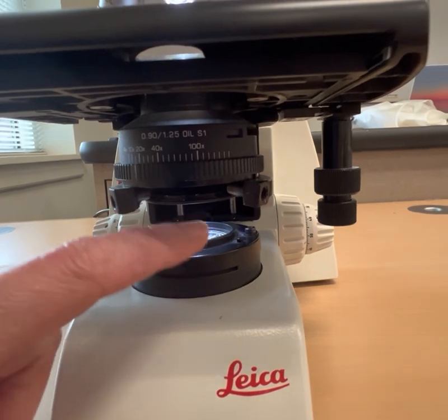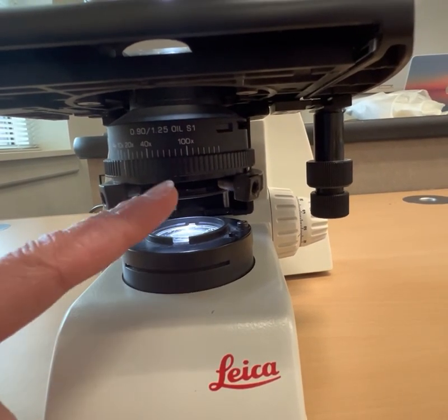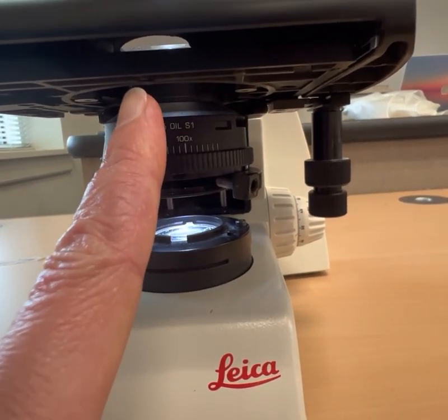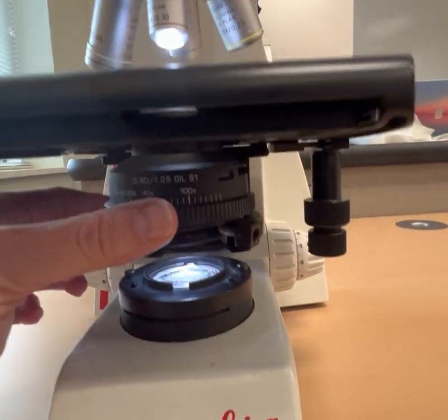So hopefully you can see the light is coming from this. This is the light source. The little light bulb is inside here shining the light up this way, up through the mechanical stage through your slide, and you're going to look at it up top. But before it does that, it goes through this.